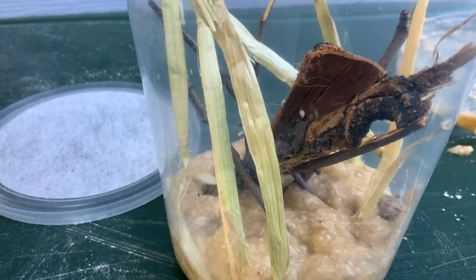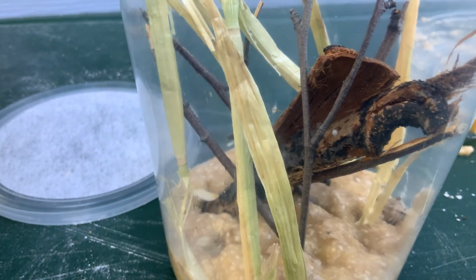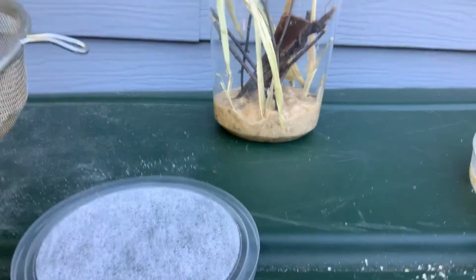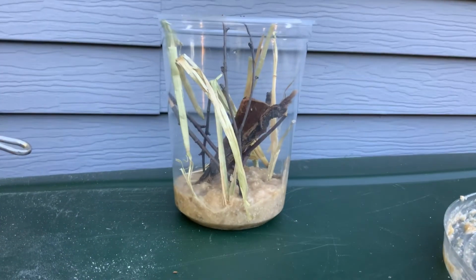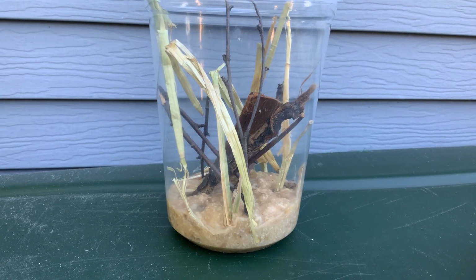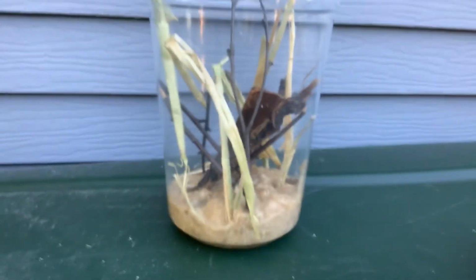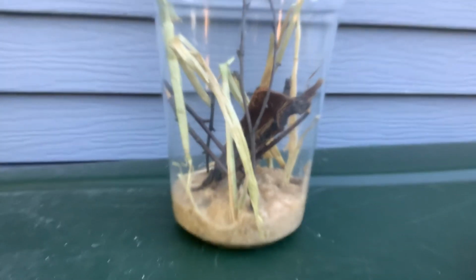Yeah. So it's just that simple to make your own fly culture. You just need a starting culture, I guess. And so now I'm going to show you how I put those flies into there, from the old starting culture. So technically, I just take this jar, and I can't show this, but you technically just tap it. And that's why the iPad's shaking. You really quickly take off the lid and continue tapping it.